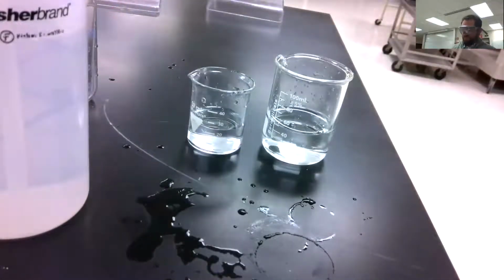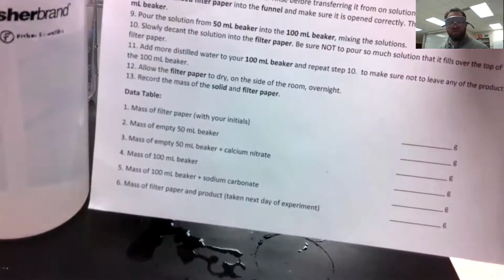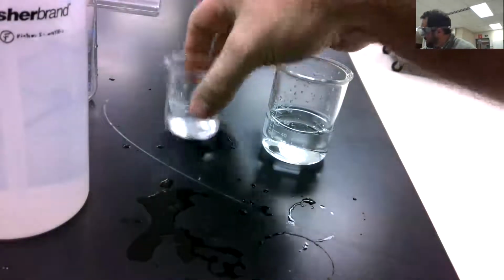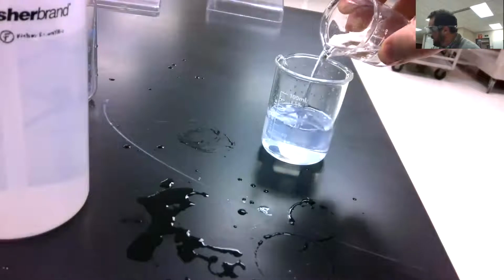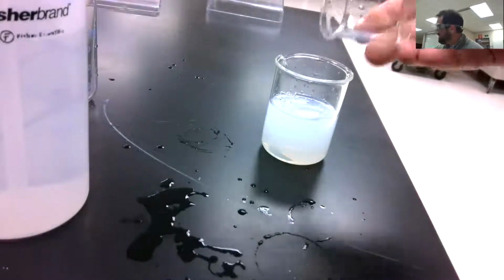Step 9. Step 9 is we're going to mix the two solutions, the 50 milliliter and the 100 milliliter. We're going to pour them together. Let's see what happens. We'll pour this perfectly clear substance into that perfectly pure substance. Well, that was interesting. You see that?